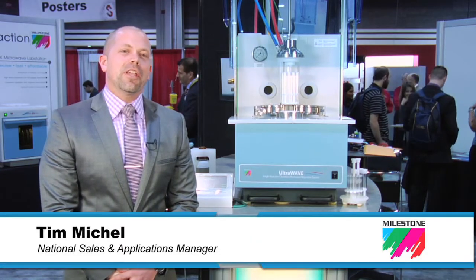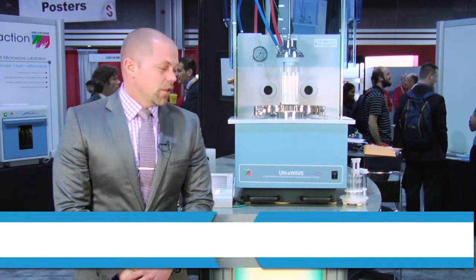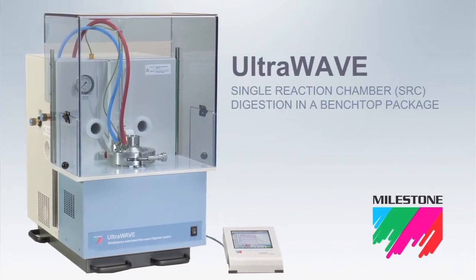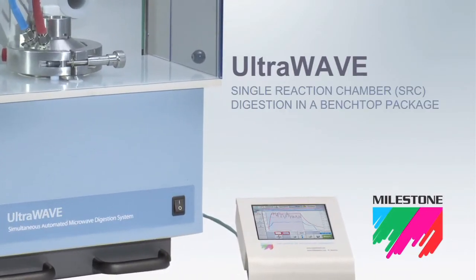Hi, my name is Tim Michael. I'm the Sales and Applications Manager for Milestone, Inc. This is Milestone's new UltraWave Microwave Digestion System utilizing single reaction chamber, or SRC, technology.